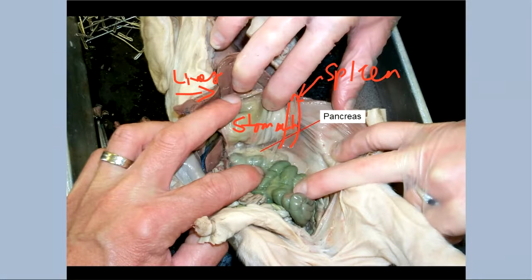I always describe it as a tongue-like organ. You know, it's long, it's flat, rounded at the end, like your tongue. And here, this is the large intestine, and here's a little piece of the small intestine.